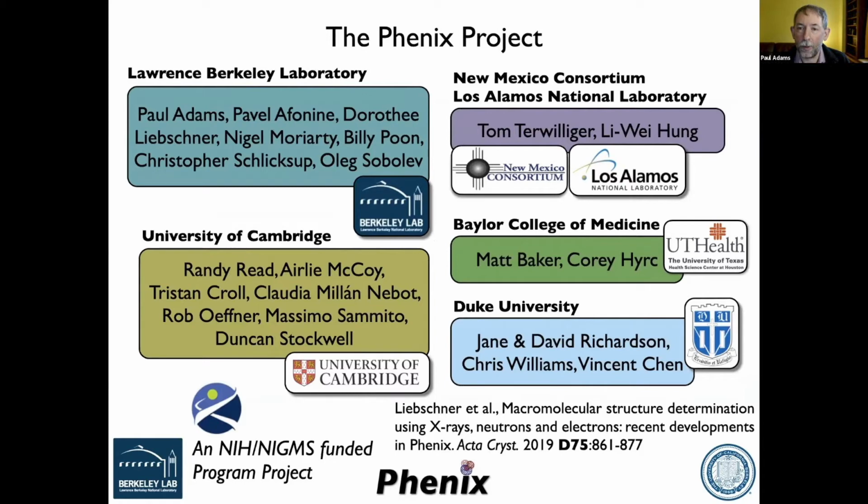What are these odd features you're talking about that we must be looking out for when looking at a map to model FSC? Well, generally an FSC curve typically has quite high correlation values at low resolution, right? In the low resolution part of that plot. And as you go to higher and higher resolution, higher frequency information, that falls off and goes to a low value. I think everybody's familiar with what those curves look like, both for a map to map and a map to model. They're not the same, but similar.